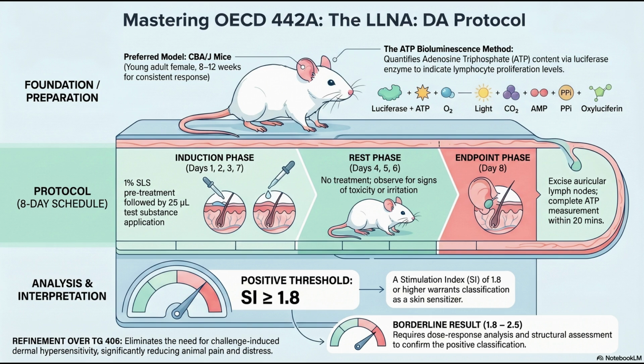And the emitted light intensity is linearly proportional to the ATP concentration, right? Yeah, completely linear. And a luminometer captures this light, providing a readout in relative luminescence units, or RLU.